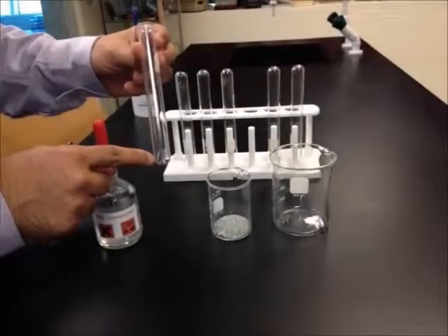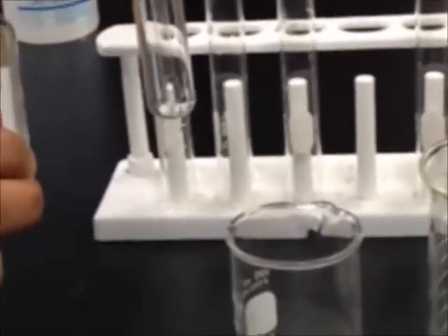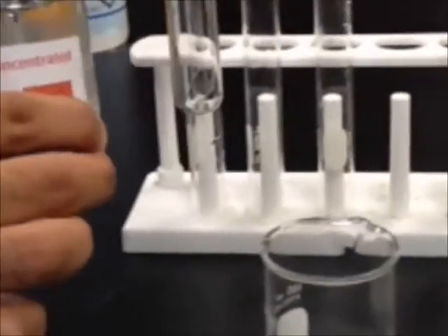Here we have some chips of magnesium. I'm going to add some concentrated acid to see the reaction between HCl and magnesium.